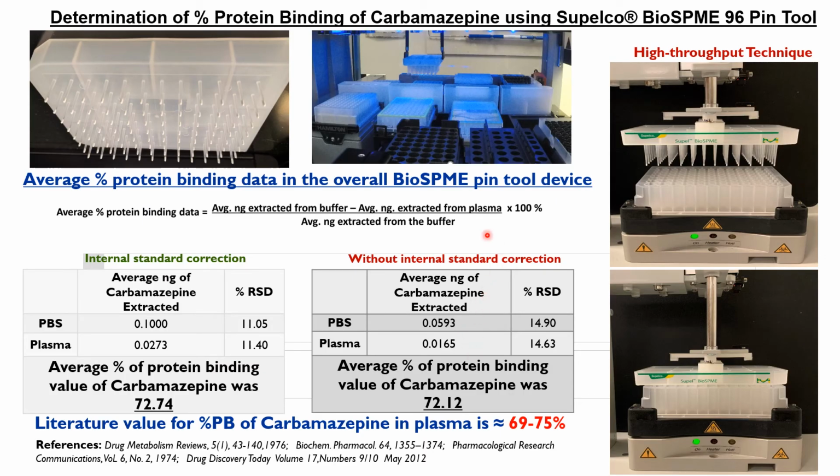Obviously, I was talking about multi-phase equilibrium, so you don't only need to measure the concentration of the component in the matrix, but also measure the affinity, this distribution constant between the free concentration and the sample component.